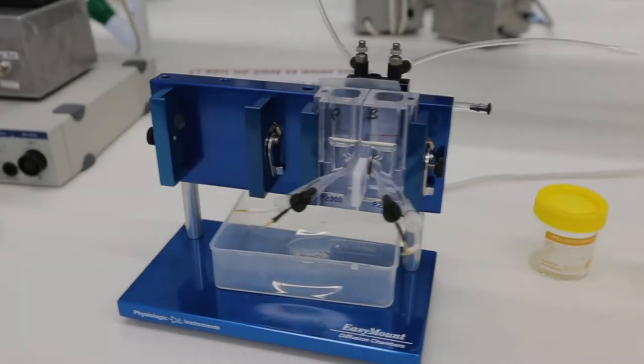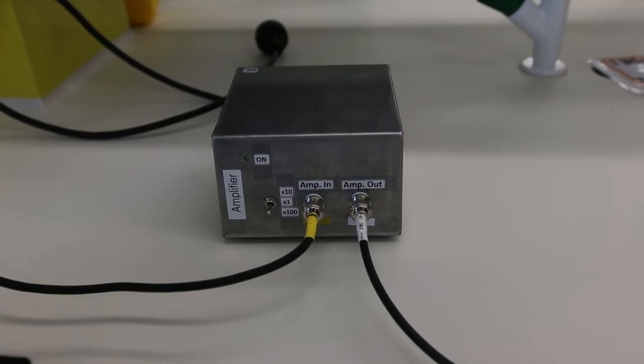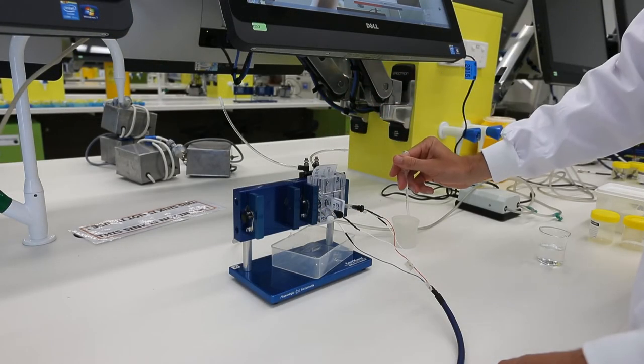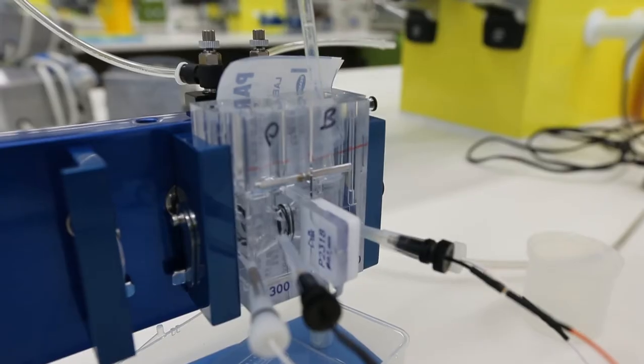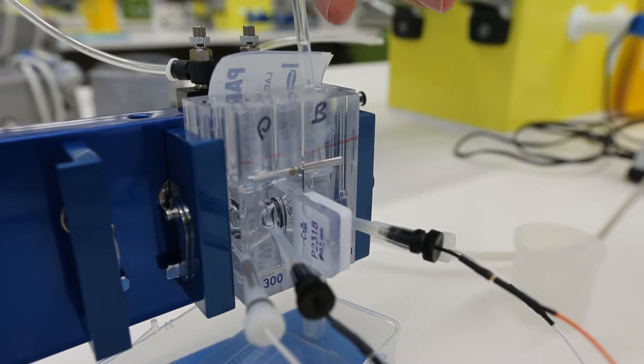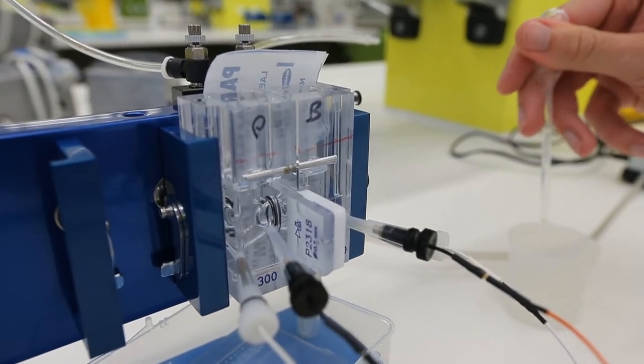In this video, having set up the Ussing chamber and obtained the offset voltage, we will now demonstrate how to insert the toad skin and take some measurements. First of all, using the transfer pipette, remove the Ringer's solution from the chamber. This is to prevent the solution from flooding out when you remove the empty tissue holder.